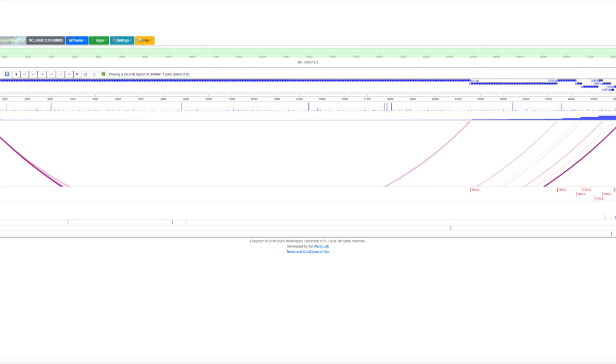The second track shows SARS-CoV-2 RNA expression measured by nanopore direct RNA sequencing performed by Kim et al. 2020. From the same study, the users can visualize recombination events detected by junction-spanning RNA-seq reads and several different RNA modifications, rotating in a dynamic track format.